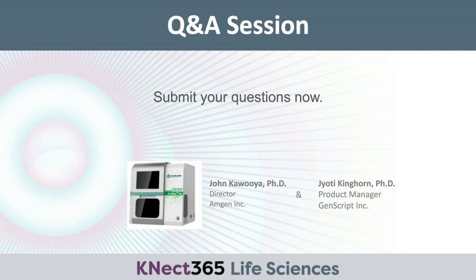That's great. Thank you, John. We have another question here. I've been testing out GenScript's magnetic beads recently using standard buffers for a typical antibody workflow. Do you have any recommendations to reduce bead clumping?